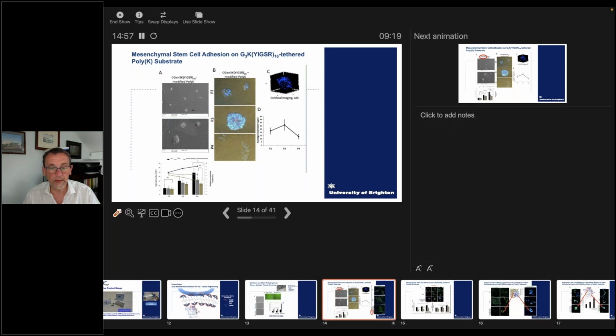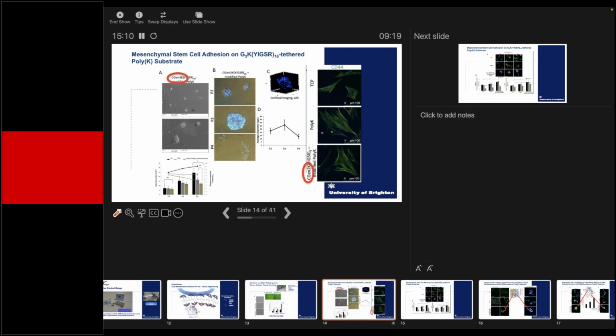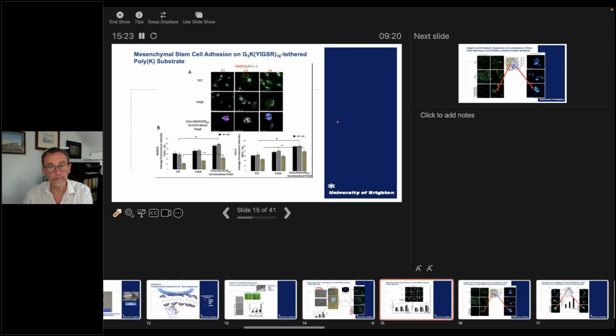We have repeated this experiment not with branched molecules exposing 16 branches, but rather 8. When you do that, you can see that the cells, rather than forming spheroids, go back to the more traditional spread-like structure and colony-forming units to which we are used to.